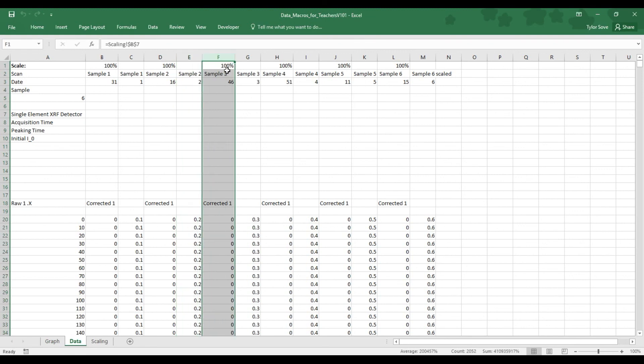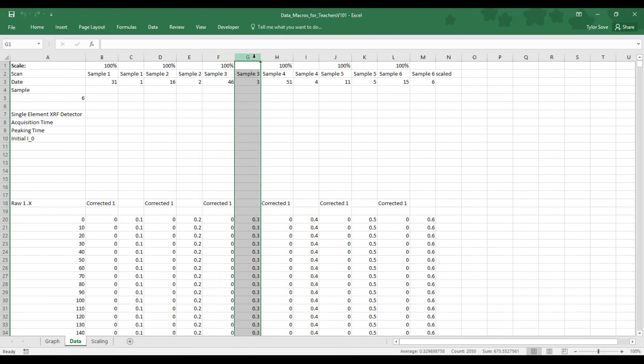And then if we follow, the pattern continues. This is the unaltered data for sample 3. This is the scaled, normalized and offset data for sample 3, and so on and so forth.